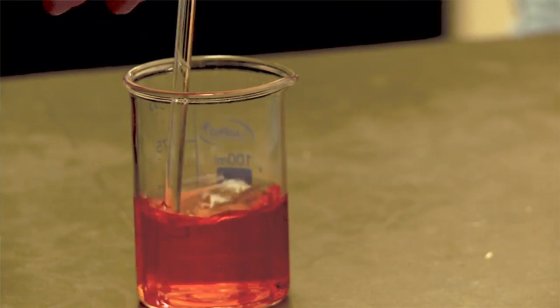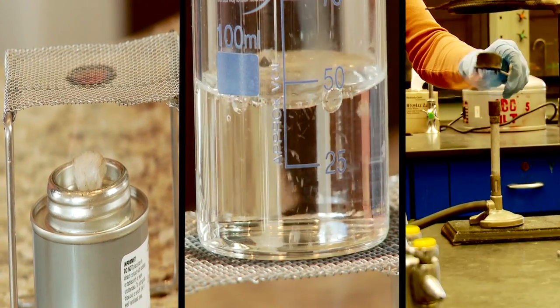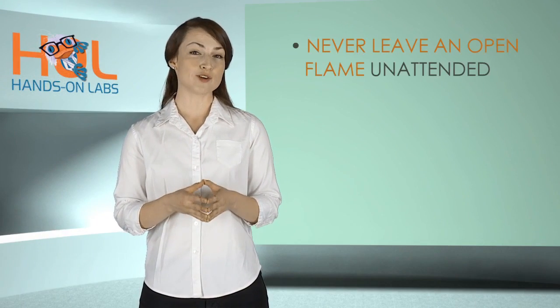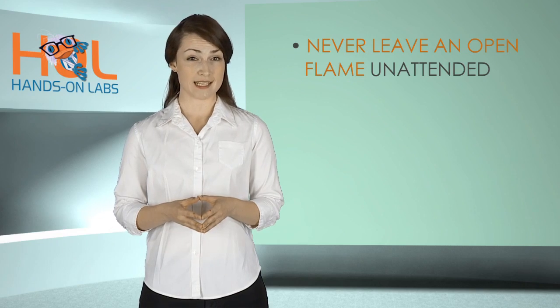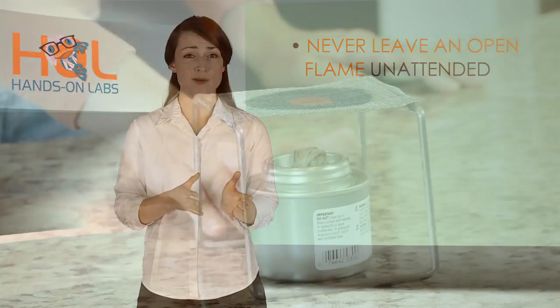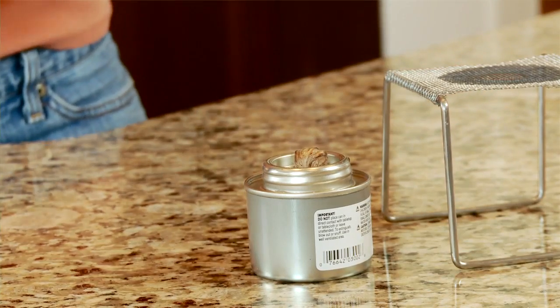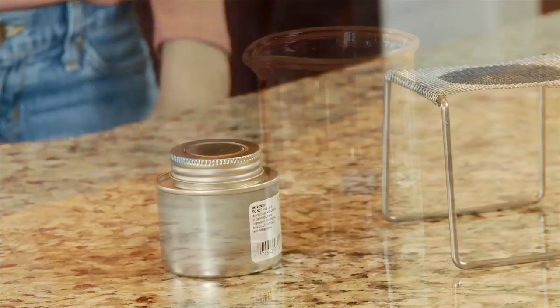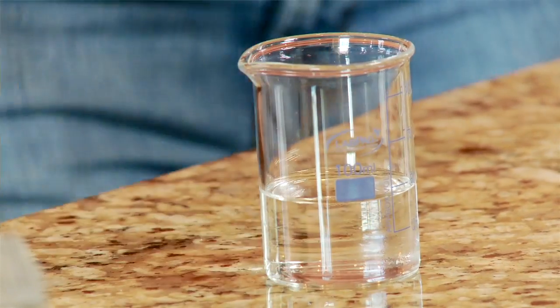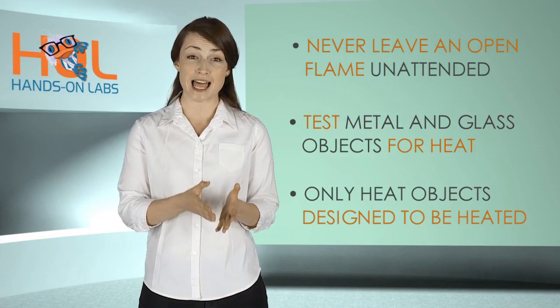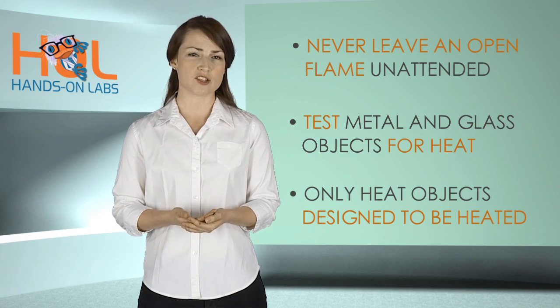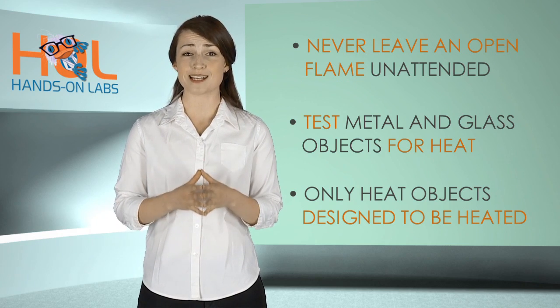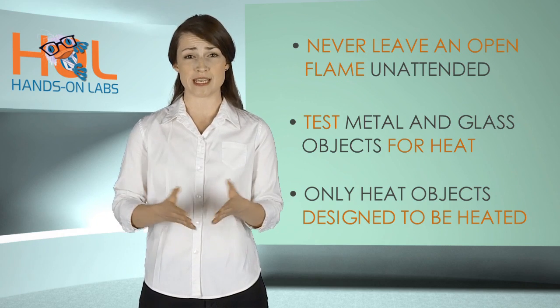In addition to caution with chemicals, remain aware of fire hazards. Open flames, heated objects, and burners can pose serious safety threats during your experiment. Here are some tips to keep in mind. Never leave an open flame unattended. It only takes seconds for loose clothing or other items to catch fire. Always extinguish heat sources when not in use. Test metal and glass objects for heat prior to handling in order to avoid burns and be careful to only heat objects that are designed to be heated. Certain glass objects such as graduated cylinders and flasks are not meant to be heated and could shatter if exposed to a heat source.